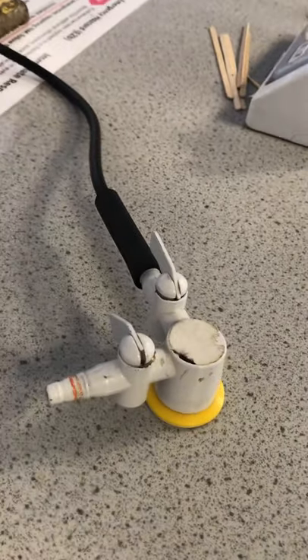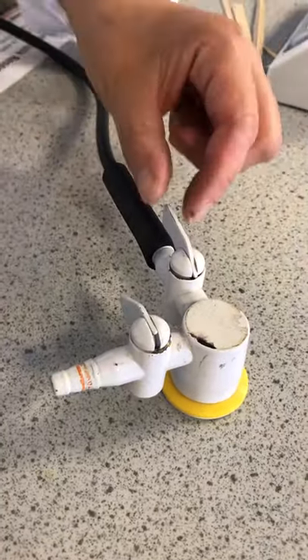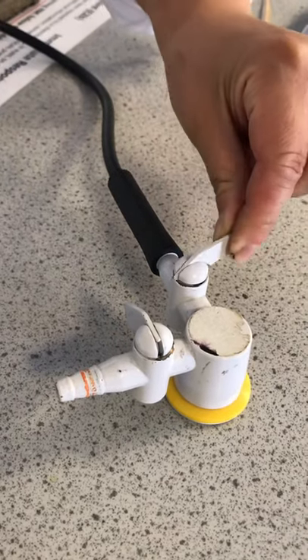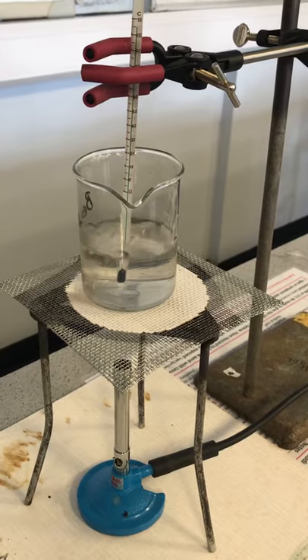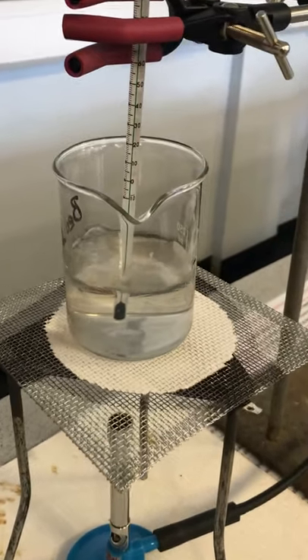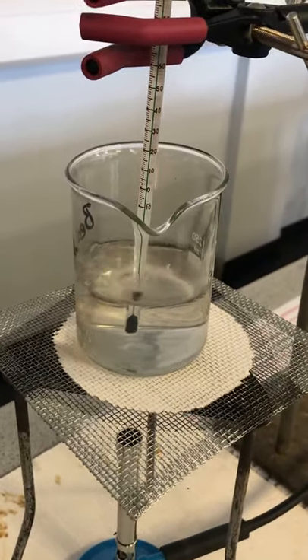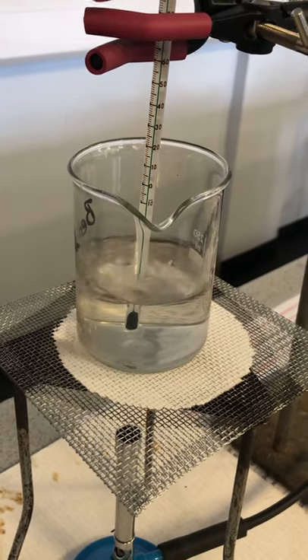Once you have taken your end temperature, simply turn off the Bunsen burner by rotating the gas tap. Leave your beaker as it is to cool down before you touch it, as it is very hot.